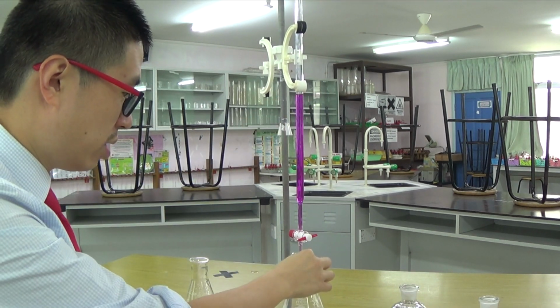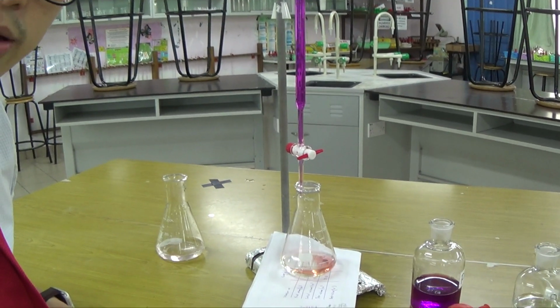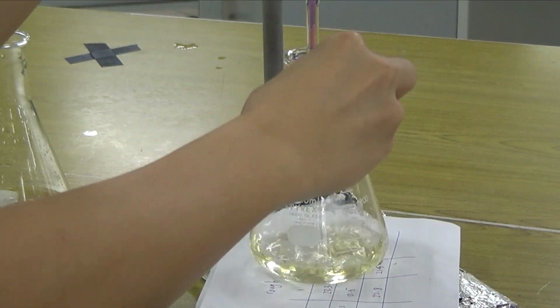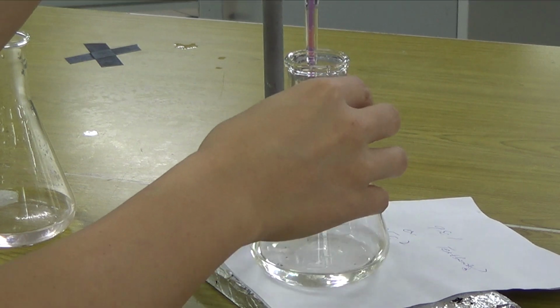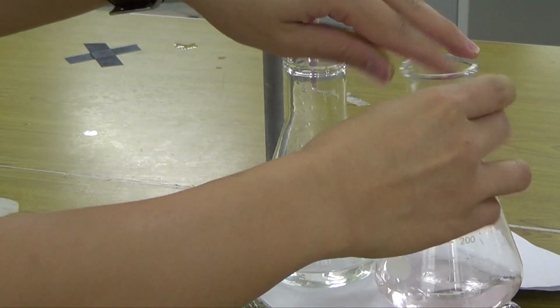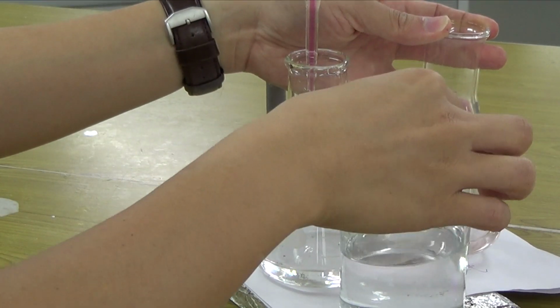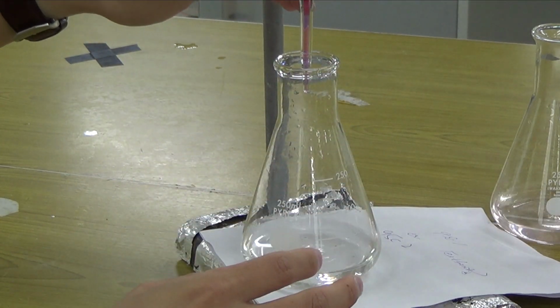Okay, so here you see it going a little bit pale pink. Let me just bring it around closer, and then you can see what's going on. You can see it going a bit pale pink there, but then we can swirl it around, and you can see the pale pink color disappears. You want it to be a permanent pale pink with one extra drop. That was what we're supposed to get, a permanent pale pink color. But this is what we have at the moment, which is kind of like the color of the iron 2+, which is kind of colorless, isn't it? Okay. Anyway, so let's get your drop by drop done first.